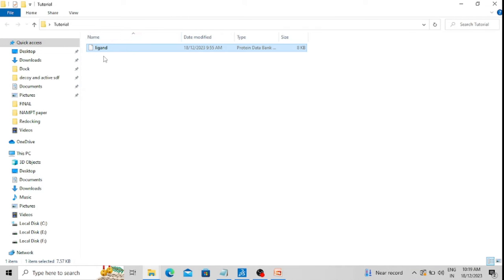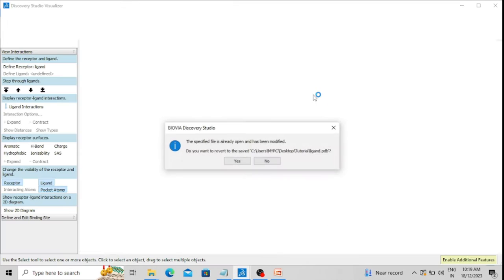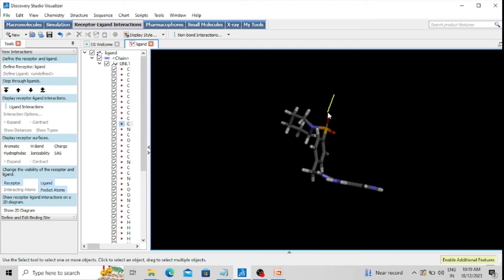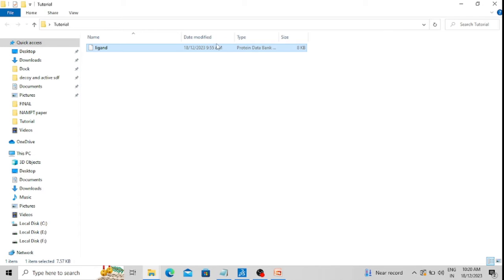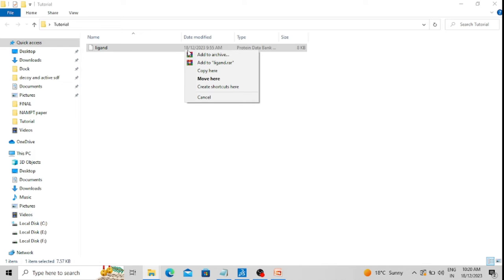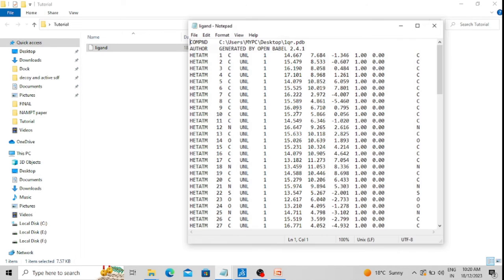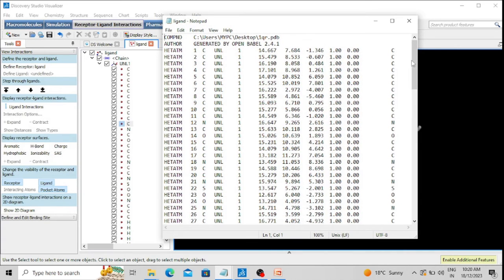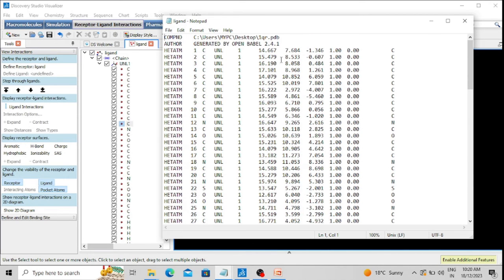In this video I am going to explain what a Protein Data Bank format actually is and what kind of information is saved in a PDB file format. This is a structure of a small chemical compound present in PDB format. I am opening it in a visualization software — BIOVIA Discovery Studio. This 3D structure can be visualized in different software like BIOVIA Discovery Studio, Chimera, or PyMOL. You can also open it in Notepad to see what kind of data is present in the PDB file format.